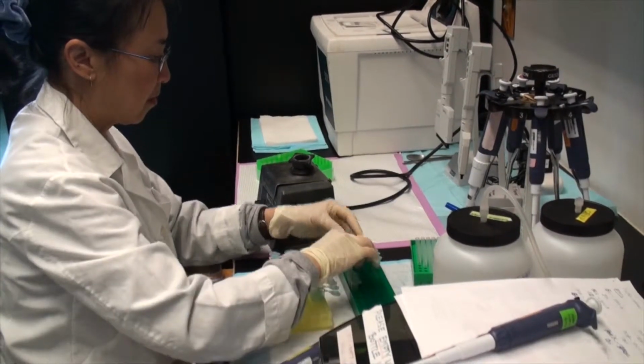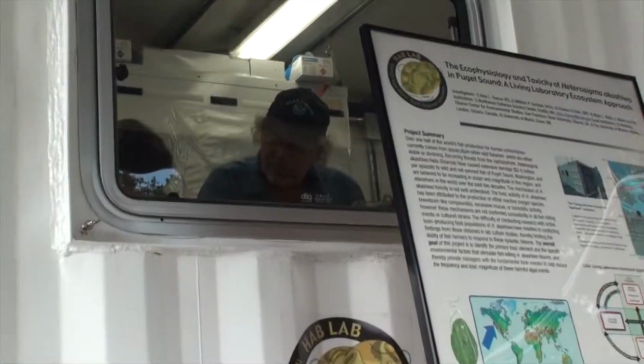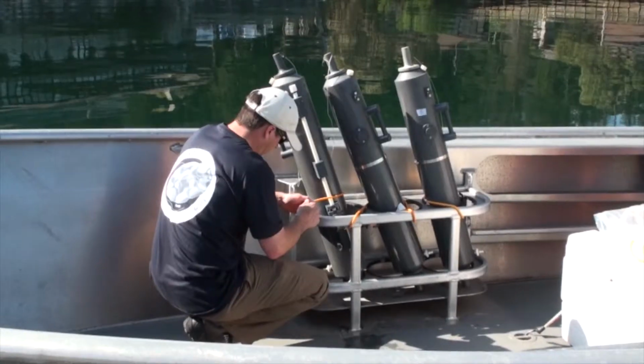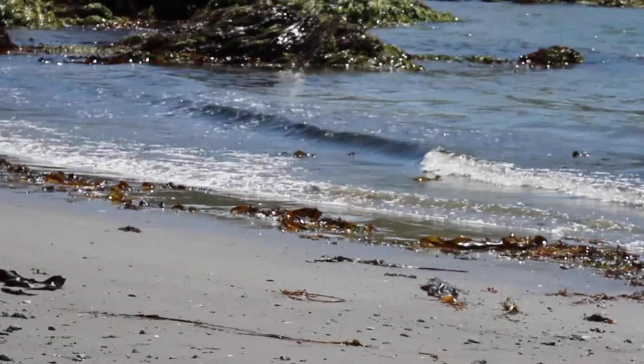It's also important to identify which species are present in the water in conjunction with certain oceanographic conditions. This helps scientists to predict when a species of harmful algae will flourish and create a large bloom capable of harmful effects. Let's take a look at some of the tools and techniques scientists use for sampling.